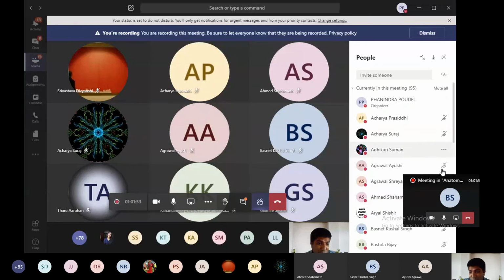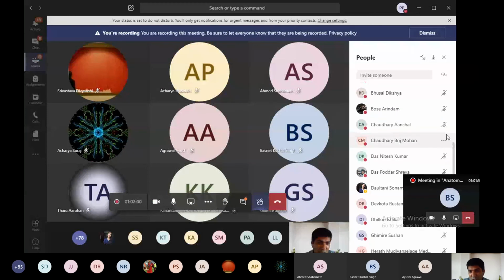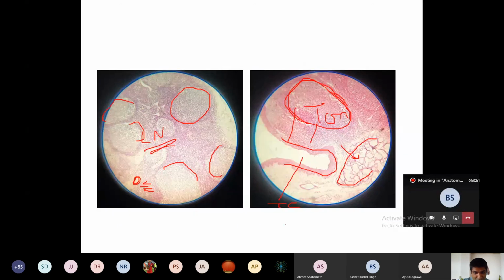Then I'll ask. Some of the students I'll pick up. We have reached the end. Now, Ansel Chaudhary, are you there listening to me? Yes, sir. Now you can give the answer. Towards the end, I went very quickly, so I'll ask some important things. Here, this slide, the first slide projected. What is this one? Are you seeing the slide?